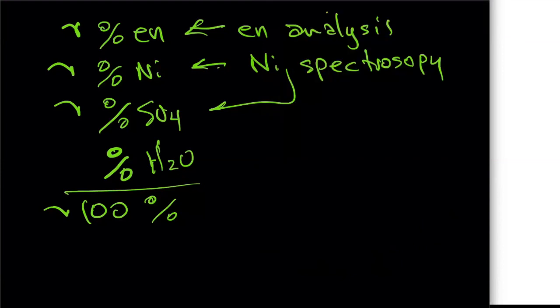Remember in the absorption, that's the second part, data, we were able to get the moles of the nickel. The moles of the nickel comes from the calibration curve because we read the absorbance of the nickel of our salt, and using the equation of the calibration curve, we were able to calculate the concentration of the nickel. If we have the concentration of the nickel, we know the volume of our volumetric flask, we can get the moles of the nickel.